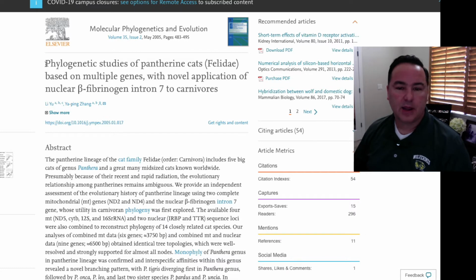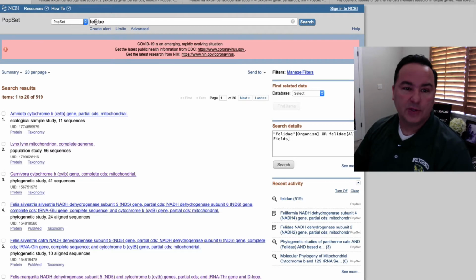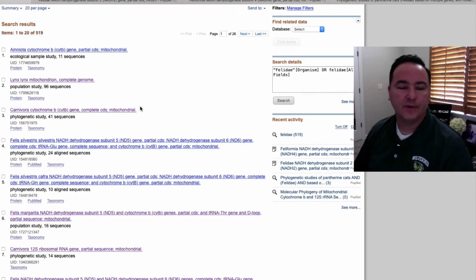I'm just going to show you what I would do. Let's say I take that title, and then I come over to NCBI, where maybe I was trying to search the Popsets for Felidae, but I was getting 519 hits. I don't want to go through 519. I started to click on the first few, but some of them were population studies, so it was all the same thing. Or like this one, oh, lynx. Maybe that one has 96 sequences, but when I open it up, it's all lynxes. I don't want a study of just lynxes. I want all different species from inside.